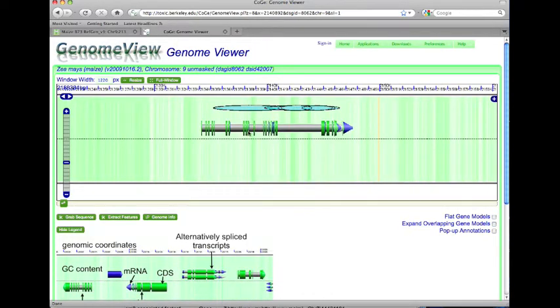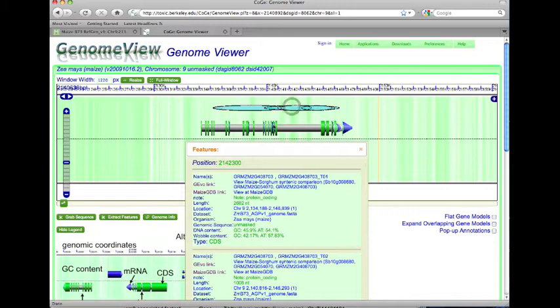Here is the same gene that we were just looking at in MaizeGDB, and because it has these large blue circles around it, you know that we were able to find at least an orthologous gene in sorghum. If you click on these circles, or if you click on the gene model itself, it'll bring up the same information. But this GEVO link is a link to another tool within CoGe called GEVO that does a comparison of related sequences.